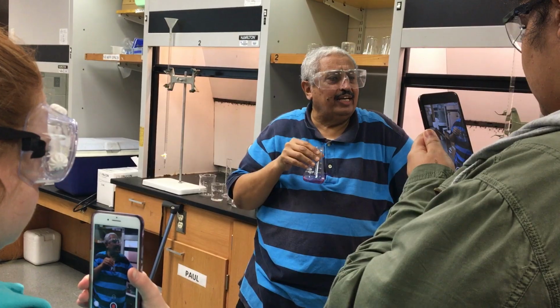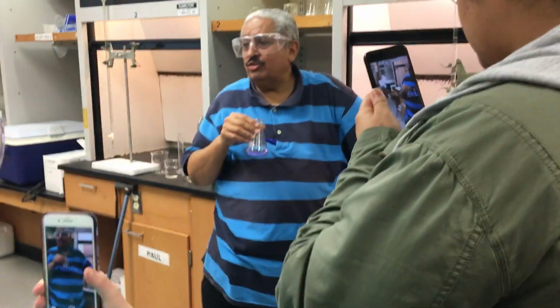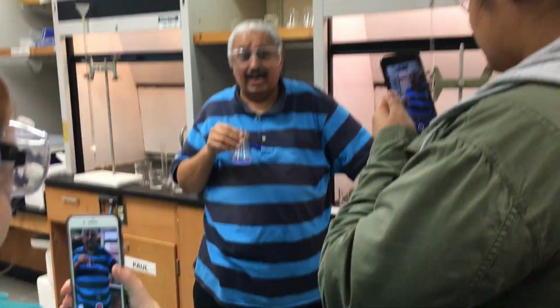I'm exhaling what? CO2. CO2 and H2O makes what? Carbonic acid. I'm adding an acid to this. See, the color is out.